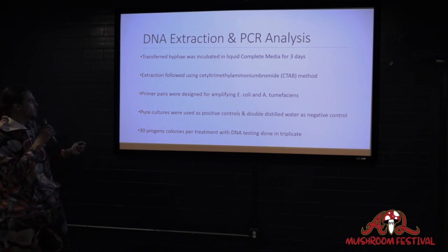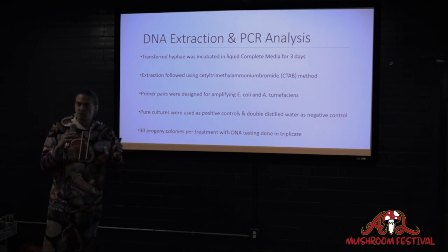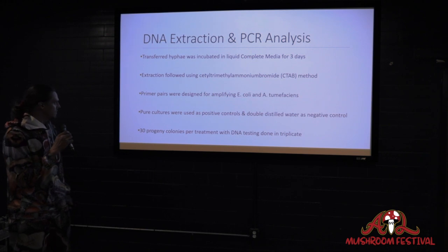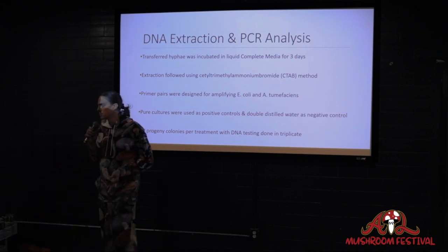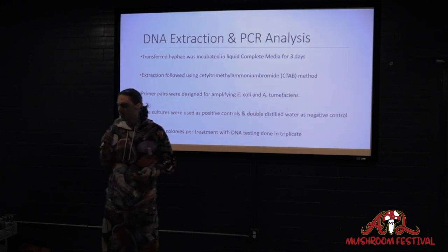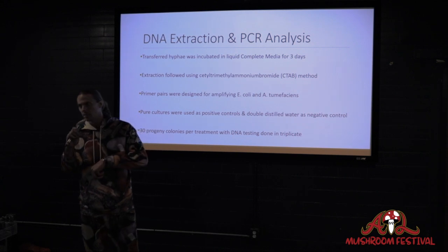And then they had primers made that were specific for amplifying the E. coli and the tumefaciens, just to make sure that they were amplifying it if it was present. Pure cultures were used as positive controls. Distilled water was used as a negative control, and 30 progeny cultures were produced for each sample and tested in triplicate, just to make sure.